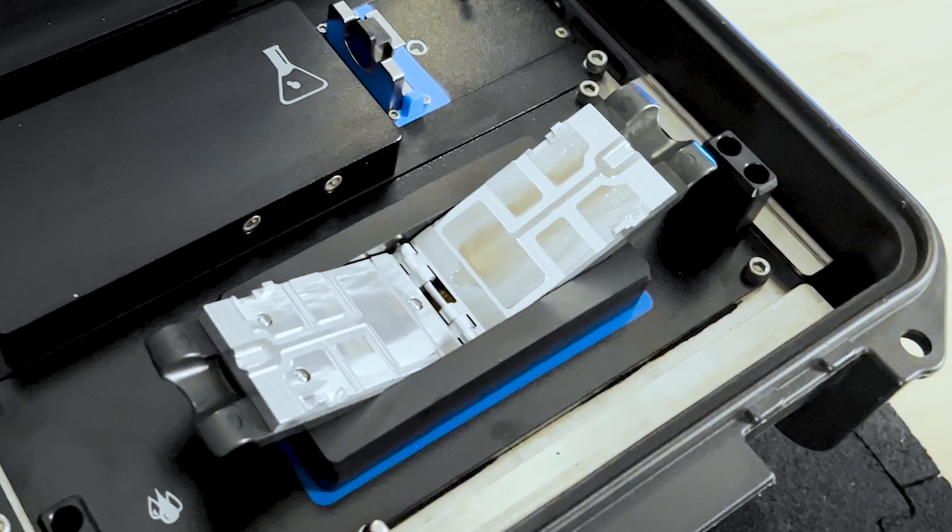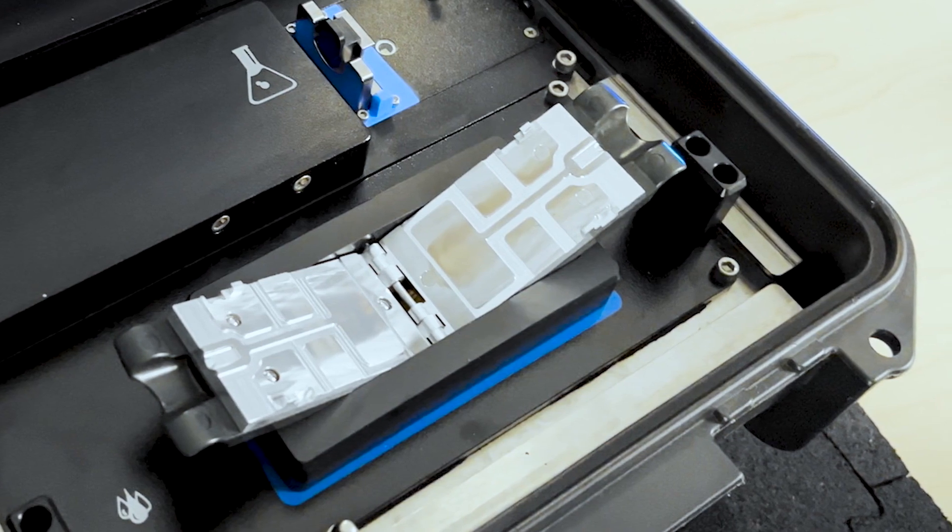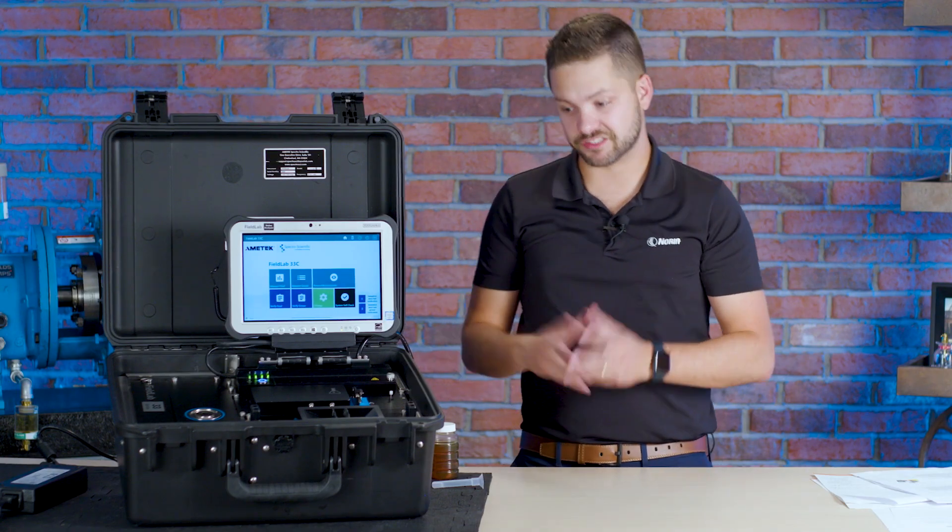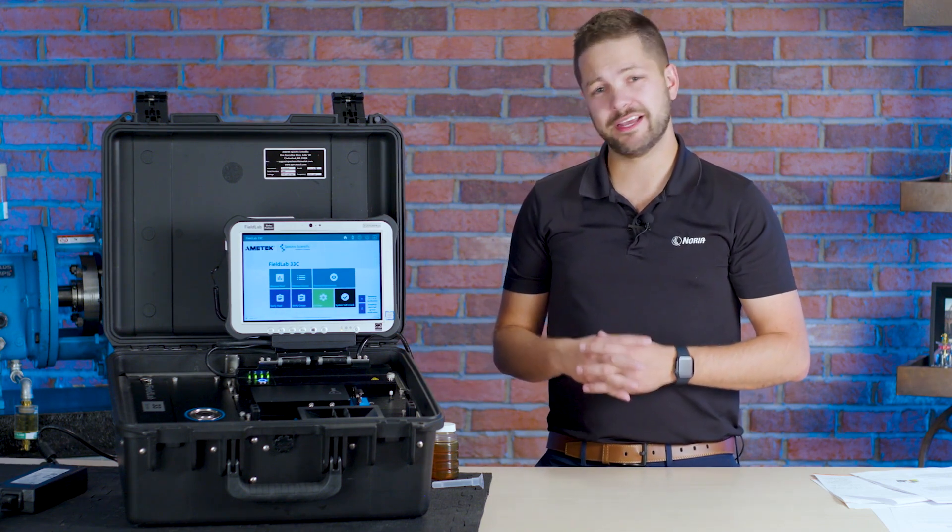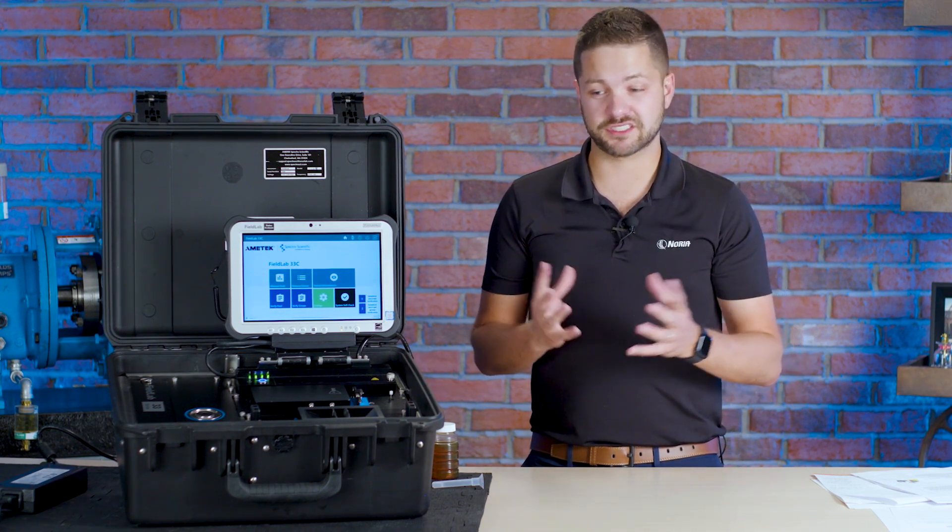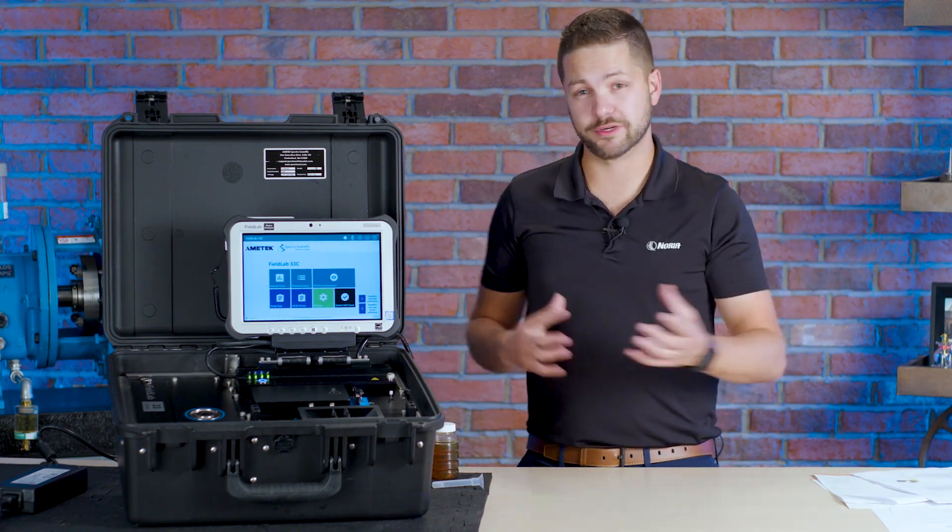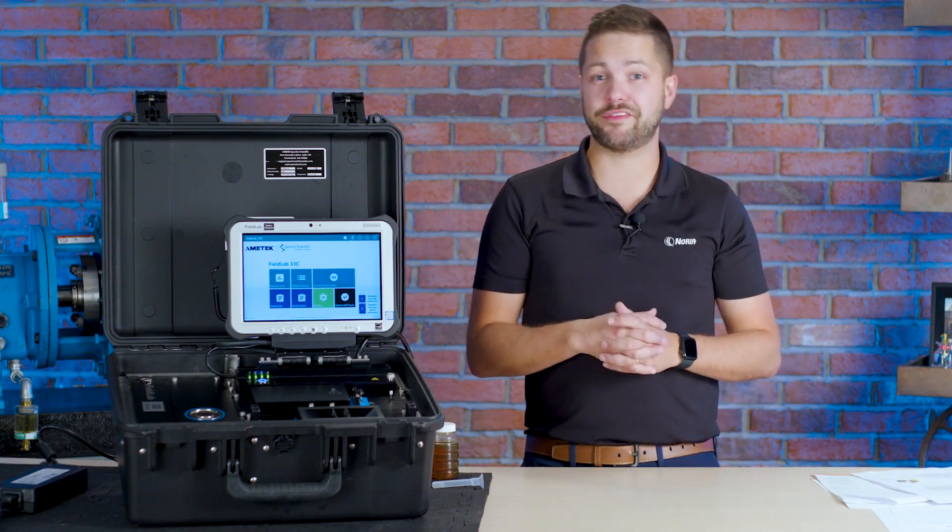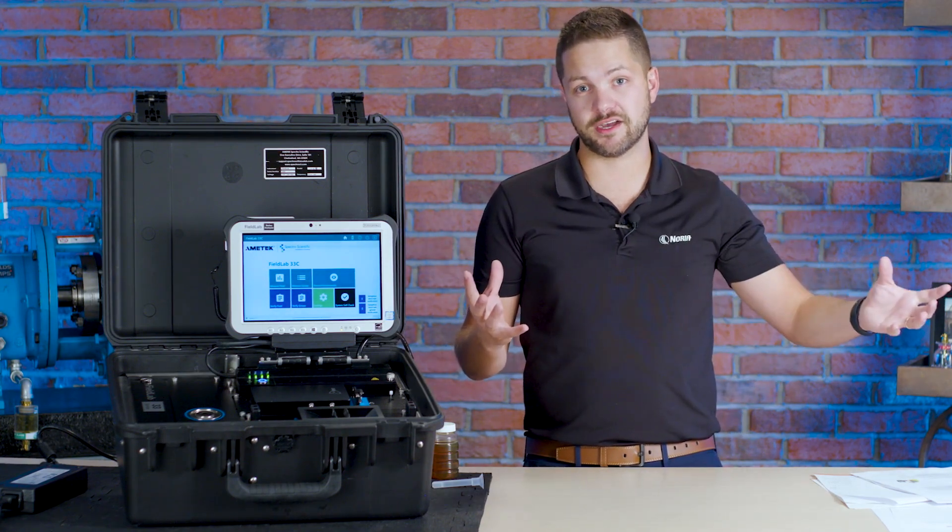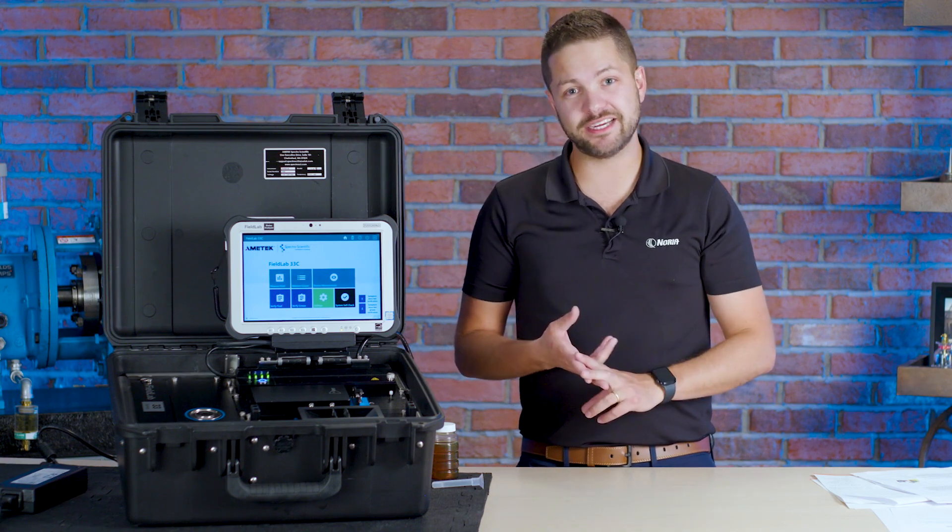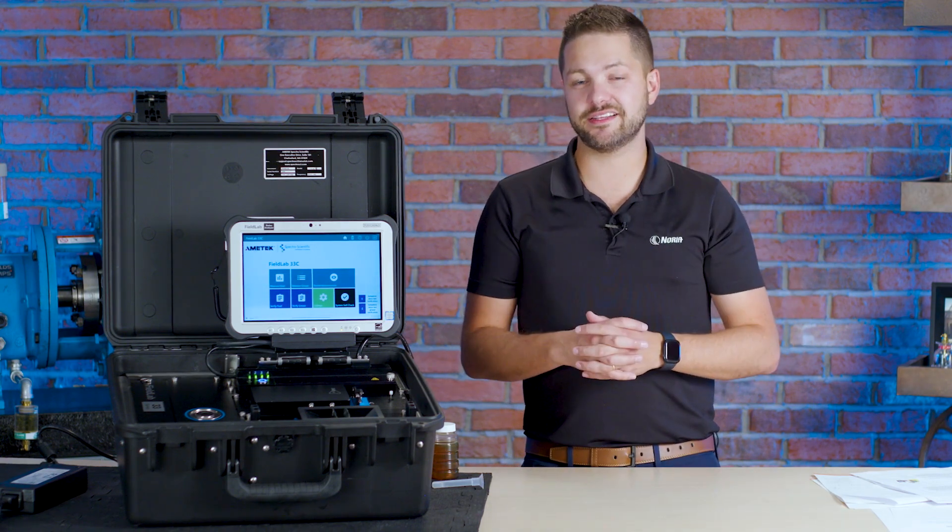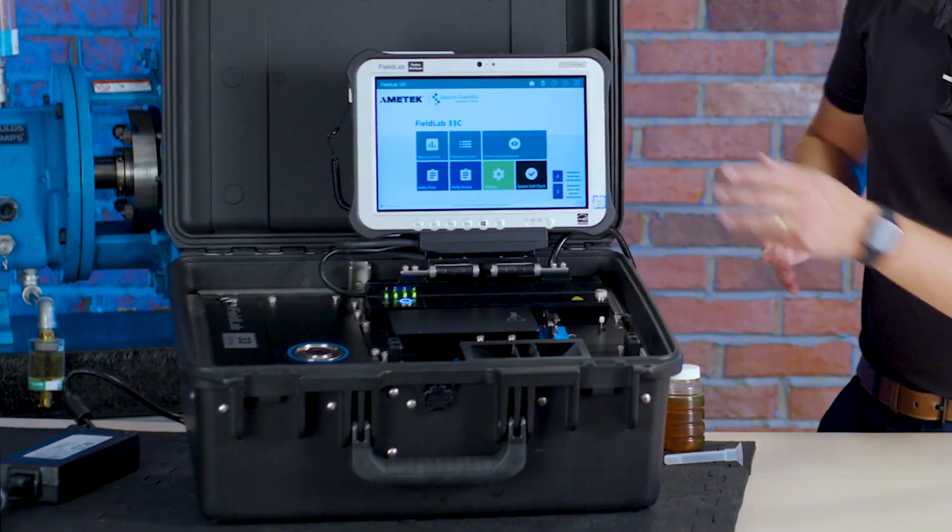Now the next thing here is the Minivisc. The Minivisc is going to give you kinematic viscosity. It's a flip top device that you use with a few drops of oil and you can determine the kinematic viscosity. That's the most common way to test viscosity in a commercial laboratory. And it's great that it has it in here because we want to make sure we have the opportunity to trend that data over time. Usually it can be an indication of maybe oxidation or contaminants getting in there and we want to make sure that we're trending that data.